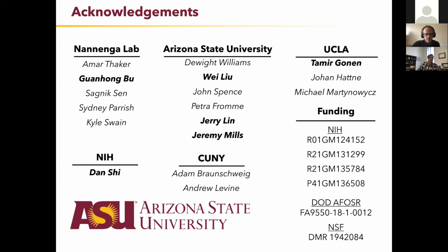The more recent thing that's come out, a lot of this work has come out from Tamir's lab recently, is using cryo-FIBs to mill crystals down, which I think is going to be the future of sample prep for MicroED. I mean, there's still some things that need to be optimized with that, but in that case, it opens the door to more cryoprotectants, for example, maybe less harsh crystallization conditions, and then using cryo-FIB. So there's a lot still to be done on optimizing sample prep, but every sample, you need to put your time in to figure out what that sample is like.